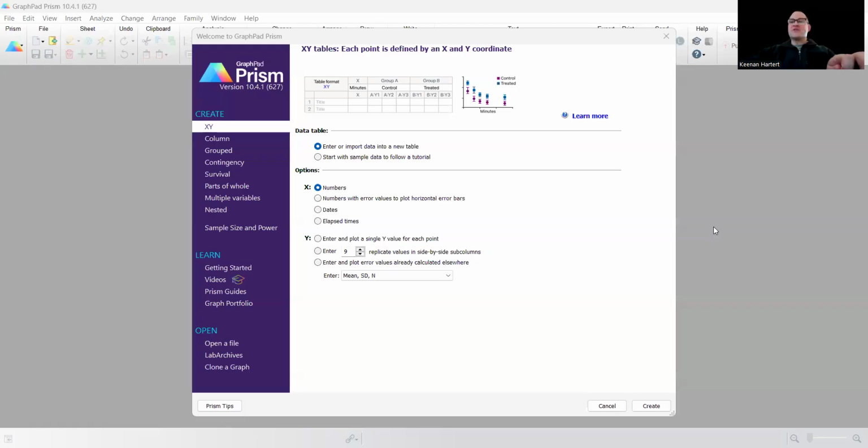I'm a biology professor at Minnesota State University, Mankato, and I study cancer research and biology education research. Today I'm going to take you through Prism's setup for dose response models. It's changed a bit in the few years, but I've been using this since 2014. So I'll show you my system, and it feels like a good little tutorial to walk through everything.